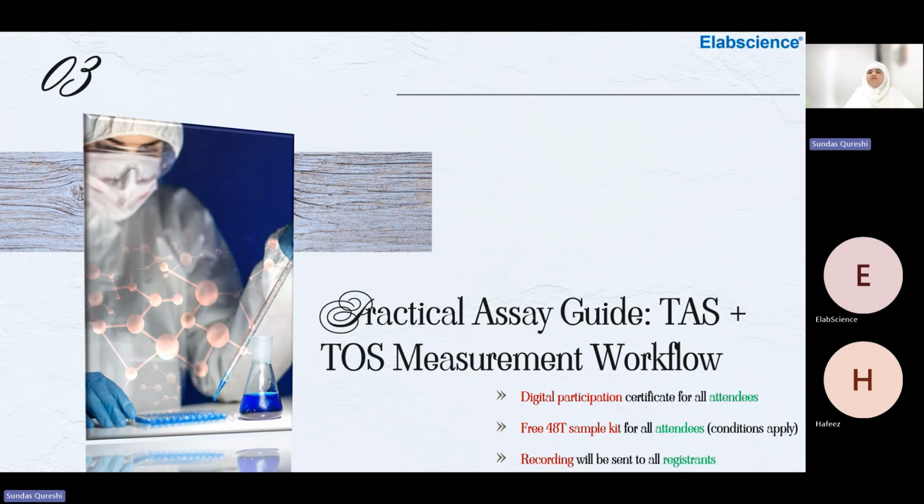Okay, now in this final section, we'll focus on the practical side. I'll walk you step by step through how the Elabscience TAS and TOS kits work and how to prepare the samples, interpret the results, avoid some common mistakes, and ensure the data quality.